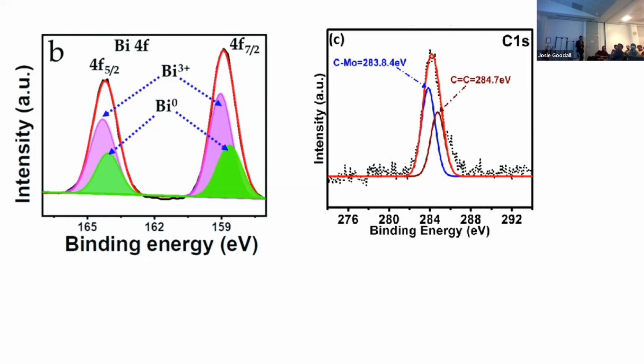We have one last one online, which I think is quick. There was a question about the 3d peaks, but I think you noted that was an error on behalf of the authors rather than an actual feature. All of these, yeah, all of them. That's the theme of the talk. Yeah. The question was, how do you differentiate between noise and satellite or shake-off peaks?